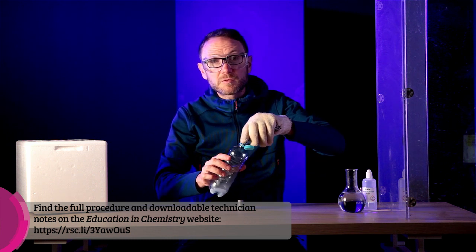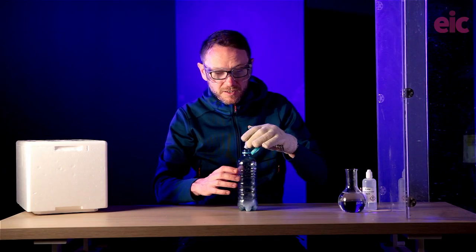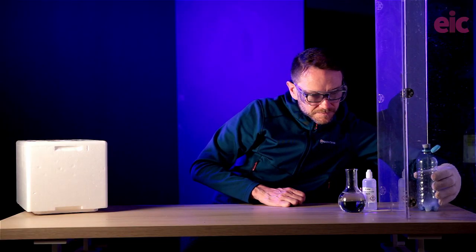CO2 is solid below minus 78 degrees Celsius, so skin contact should be avoided. I'm using an insulated glove here to pop a few pieces into this 500cm³ cube PET bottle made for a carbonated beverage. I'm going to pop the stopper on and behind this safety screen. Dry ice is so named because under atmospheric pressure it sublimes straight to the gas without passing through the liquid phase — a gas which at atmospheric pressure is going to take up about 800 times more volume than the pellets. So I'm hoping that this bung will pop off at some point during this video when I leave it behind this safety screen.